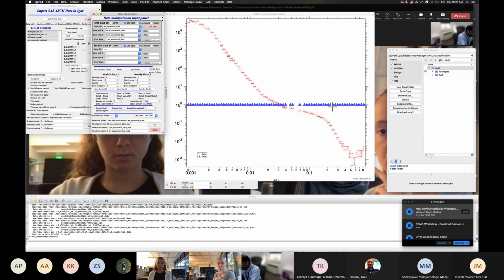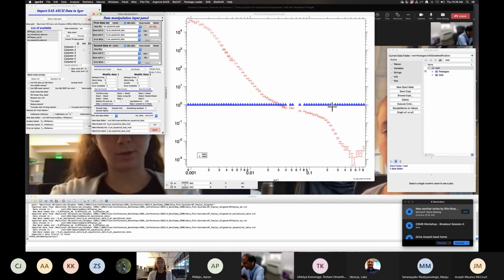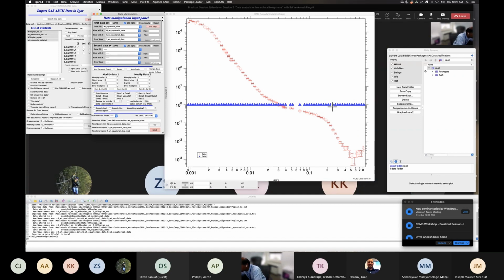One second. Where is it gone? Where is it gone? Oh, I got it. Those are DAT files. That's why. There you go.